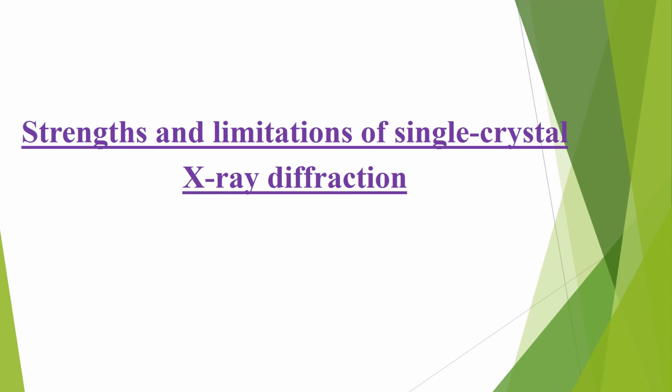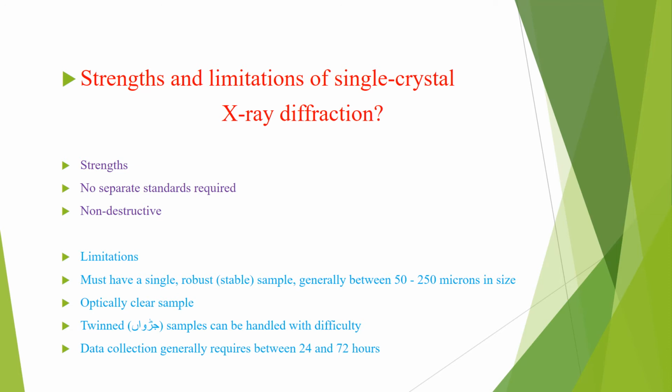So here we are going to discuss the strength and limitation of single crystal X-ray diffraction. First, we are going to discuss the strength of this technique, and then after that we will have a look at some limitations that occur using this technique.